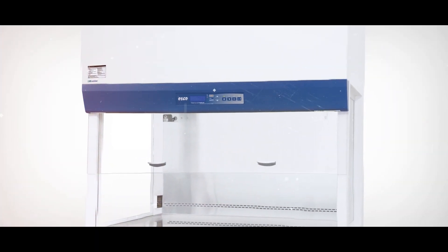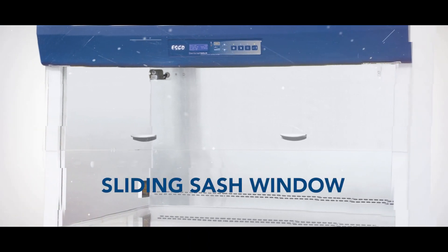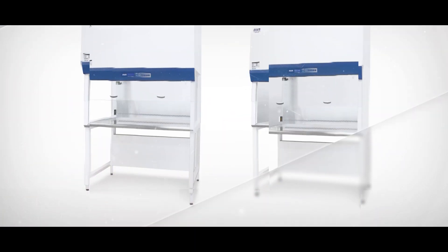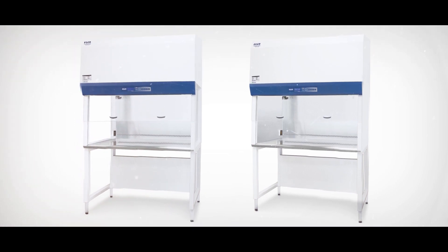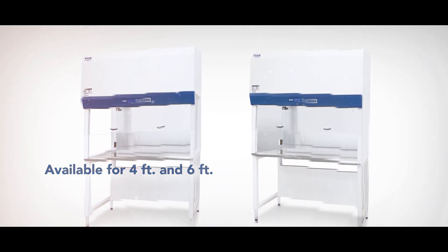ESCO now gives you the option of choosing a sliding sash window for the Airstream Vertical Laminar Flow Cabinet. This new feature is available for glass LVG and stainless steel LVS sidewalls in both 4-foot and 6-foot sizes.